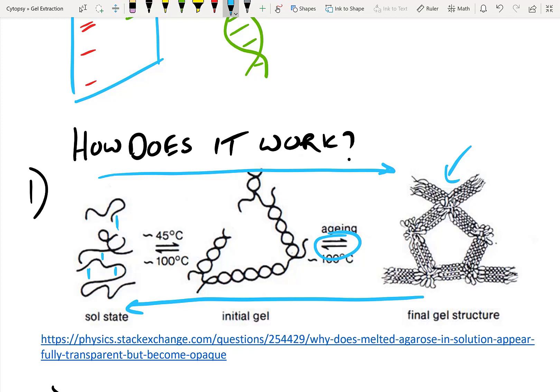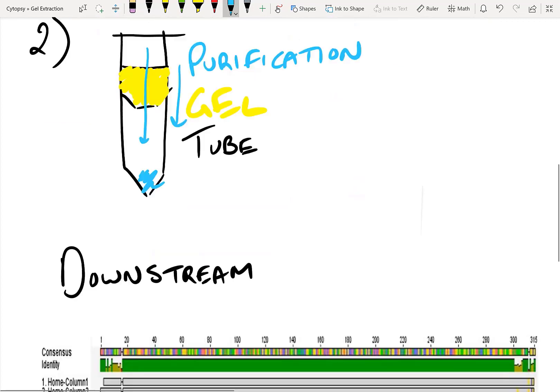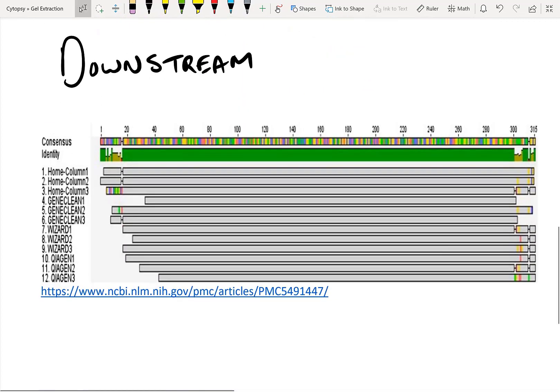The same can actually happen using a buffer, and this is what happens when you use one of the many commercially available gel extraction kits, like the one we're going to look at today via a protocol. After we've liberated the DNA from our agarose, we're going to run it through a column, and this column is going to bind the DNA. We'll do a few wash and elution steps, and finally collect it at the bottom of the tube, ready to use downstream — in our case, for sequencing.